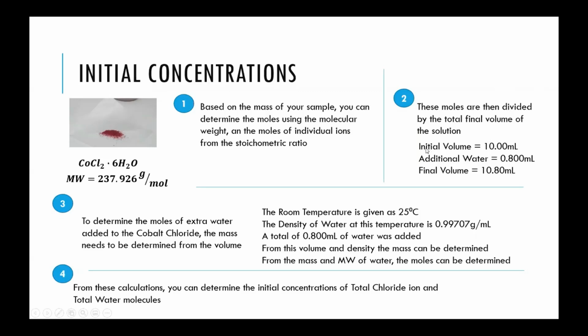So in the video, the initial volume is 10 milliliters, and the video adds 0.800 milliliters for a final volume of 10.8 milliliters.